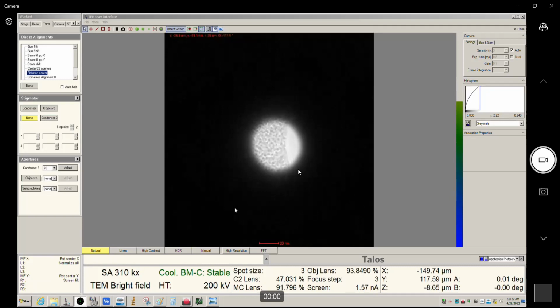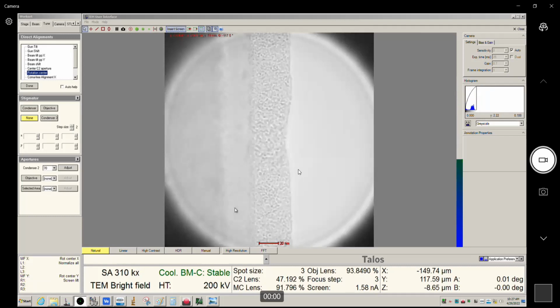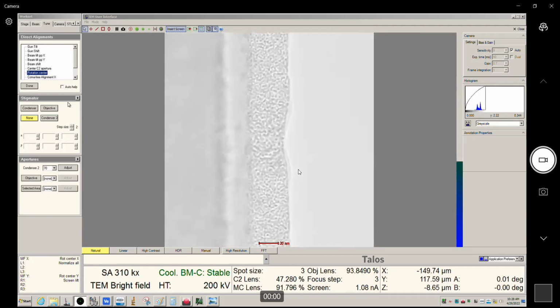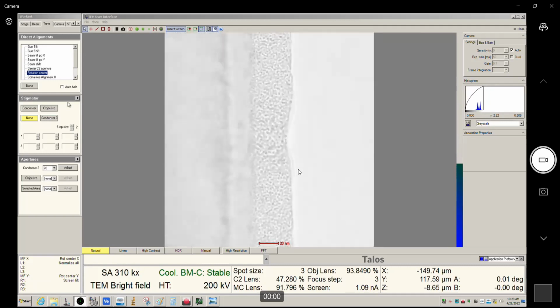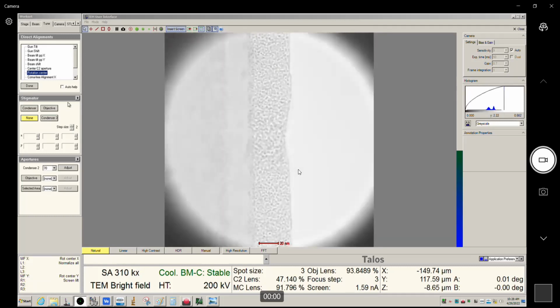And then if I go back, there we go. Now we can actually check this and see how close we were. A little bit better. Let's see here. All right, so that looks good. Let me go back and check this out a little bit more.